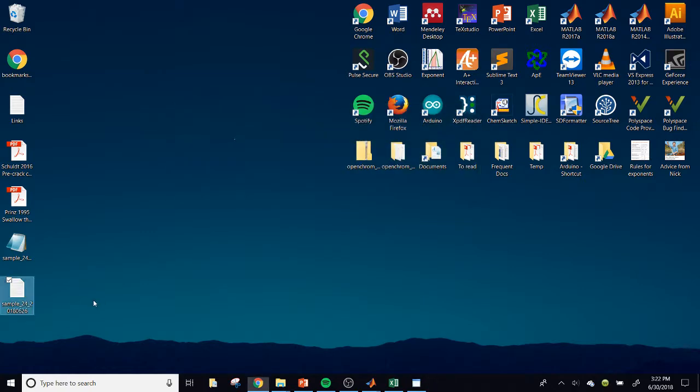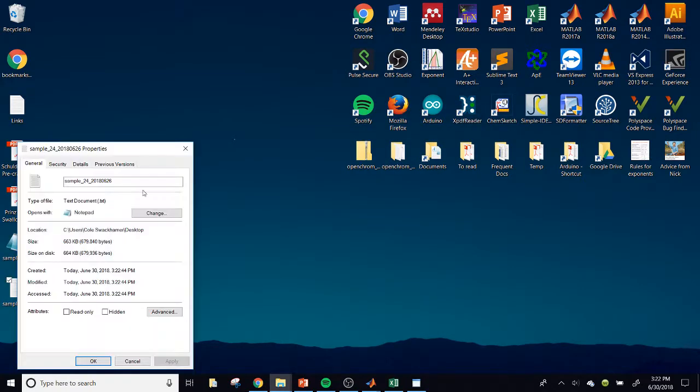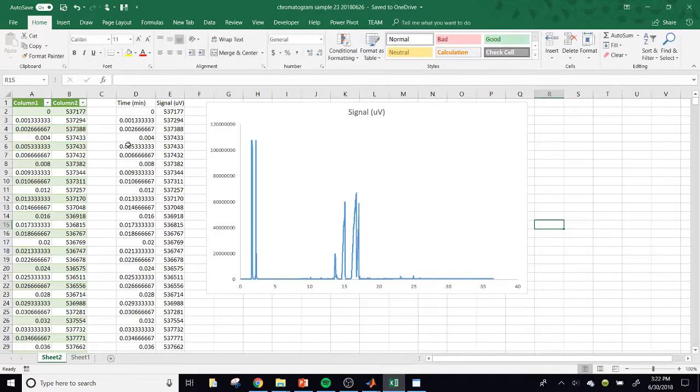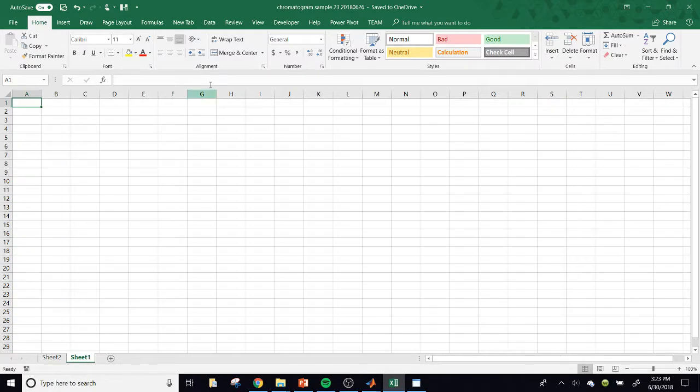Let's see. Now if I right-click, this is a .text. So there you have it, folks. That's how you could open that file. Here's the one I did in the last video. Let's just prove that it worked.